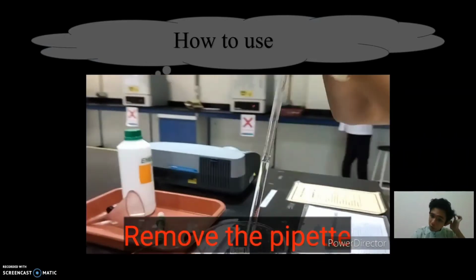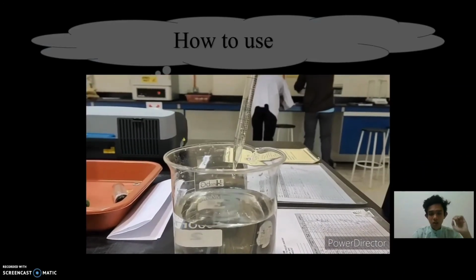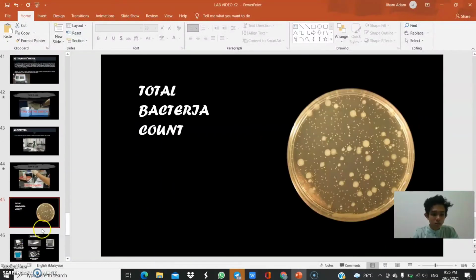And remove the pipette in the beaker, in the different beaker. And that's all, just the pipette. And thank you.